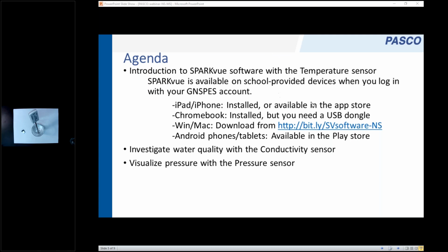Okay, if you see the two screens, then take your mouse, or if you have a touch device, I don't think this will work, but hover over the dividing line, whether it's visible or not, between the two screens, and look for a double arrow when you hover over that. And then when you see the double arrow, hold down your mouse and drag either up or down to make that screen bigger.